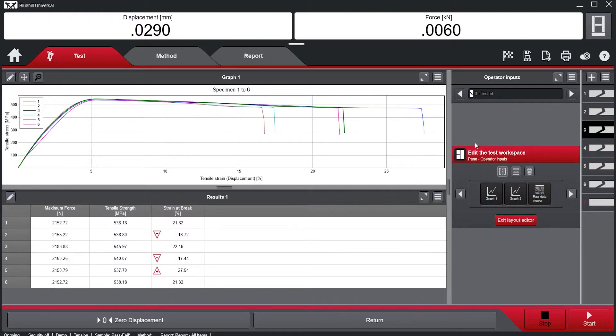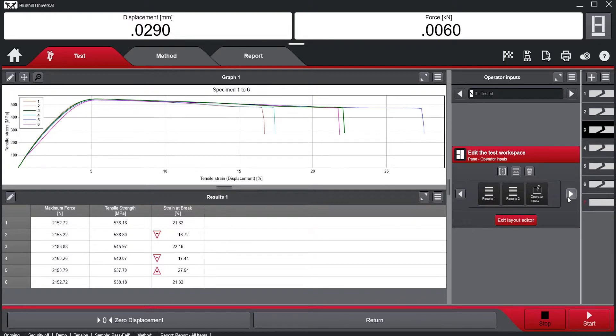Editing the layout of the test screen, we can place the Pass-Fail module wherever is convenient for the operator.